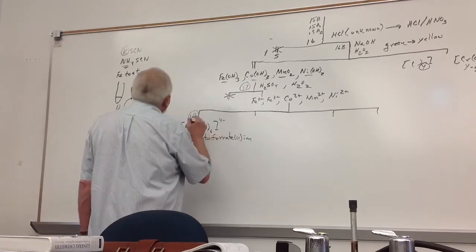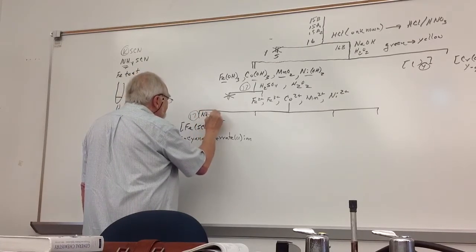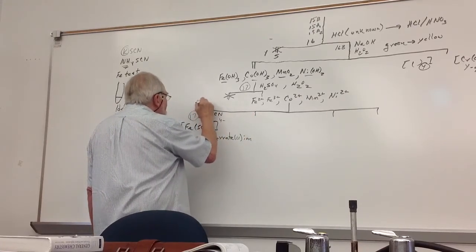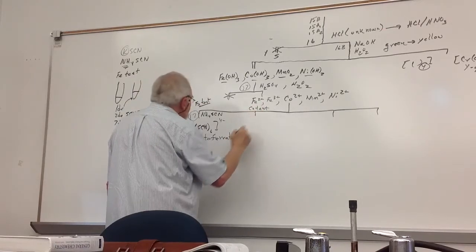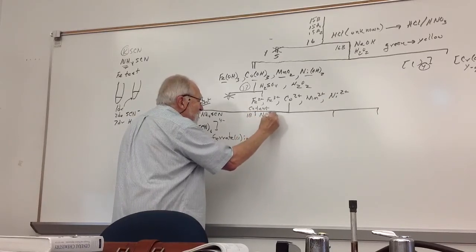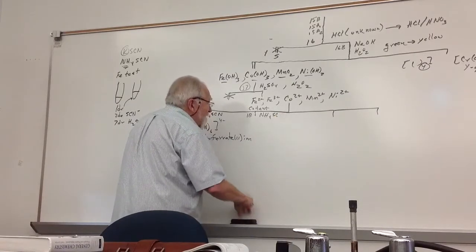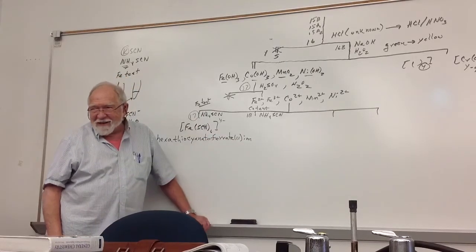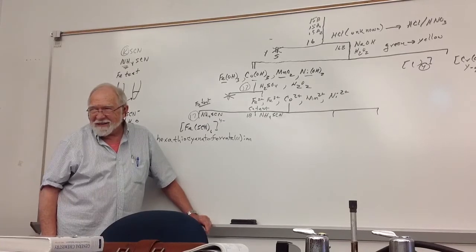And I forgot to write the reagent here, so I'll write it here. Because right here I'm going to do my cobalt test. This is my iron test. Here's my cobalt test. This is procedure 18. Whoops. You're adding what? Ammonium thiocyanate again. And you say, no, that can't work. Yes? Back to the iron.